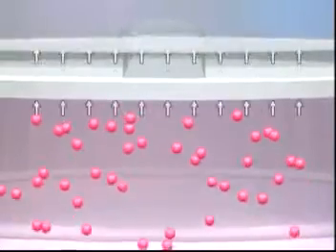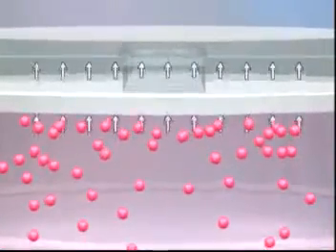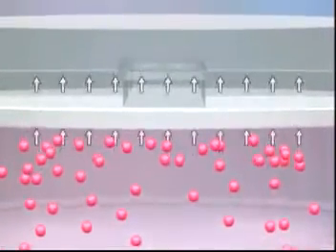This presses the sample through the membrane, successfully removing particulates as the fluid moves into the upper chamber.